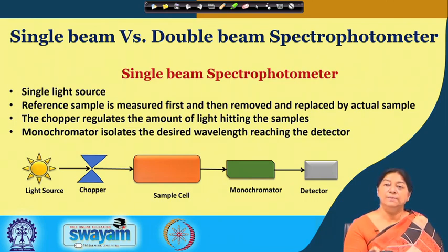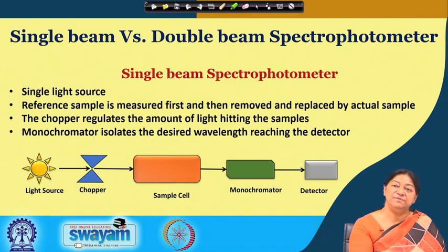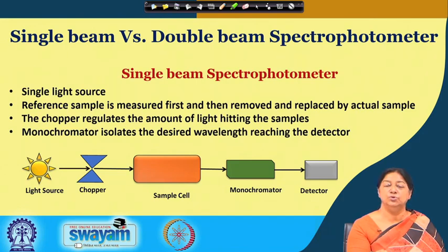light. To eliminate the contribution of the buffer, to understand only the absorbance that is given by the protein, we first put the reference cell in the sample holder and then auto zero the instrument, knowing that this buffer is not going to contribute to the overall absorbance. We then put in the sample holder with our protein solution in the same buffer, and whatever absorbance is observed, since it has already been auto zeroed, is due to the protein or the sample alone.